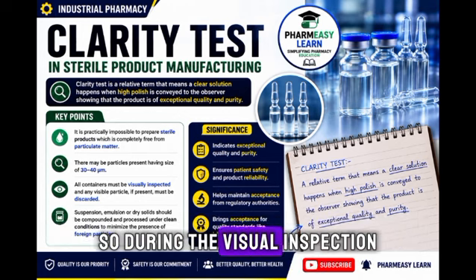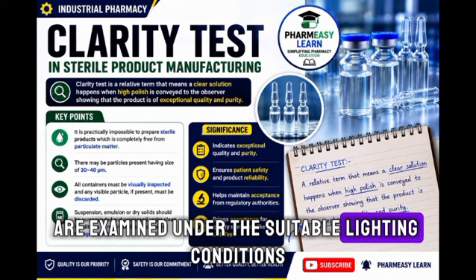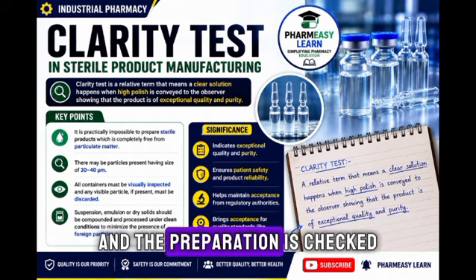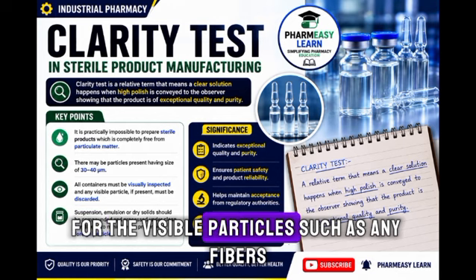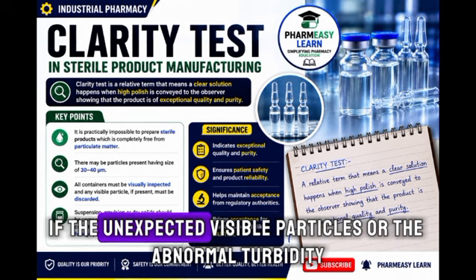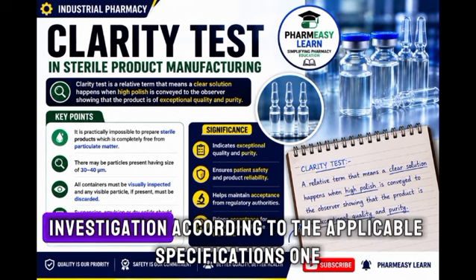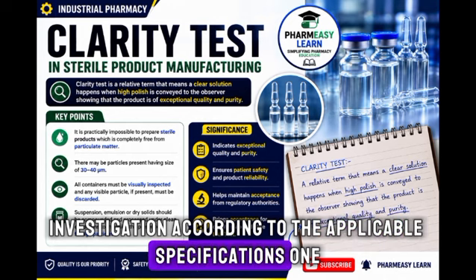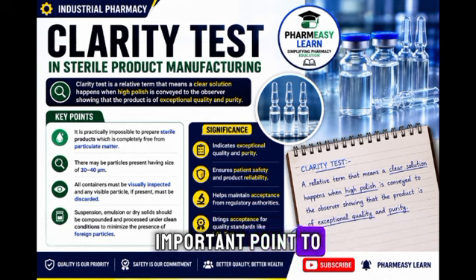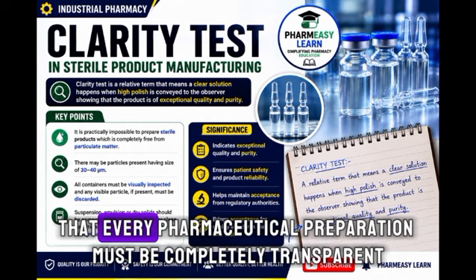During the visual inspection, the container and its contents are examined under suitable lighting conditions. The preparation is checked for visible particles, such as whether any fibers, precipitates, or other foreign matter are present or not. If unexpected visible particles or abnormal turbidity are observed, the product may require further investigation according to the applicable specifications.